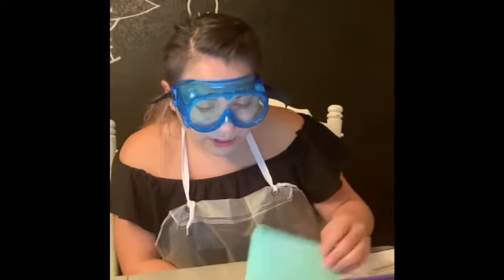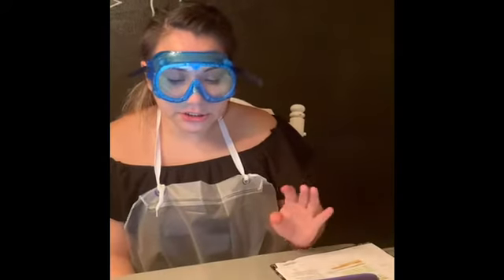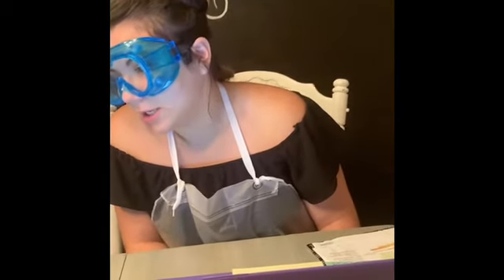For data table 1, I did the titration of vinegar and sodium hydroxide. For the mass of vinegar, we did it 3 times, by the way, so I could see a difference, or to see what happened, or even to see my calculations along with the vinegar that I got from the kit. For the mass of the vinegar for sample 1, I got 4.9 g. Vinegar sample 2, I got 5.06, and for sample 3, I got 5.01.